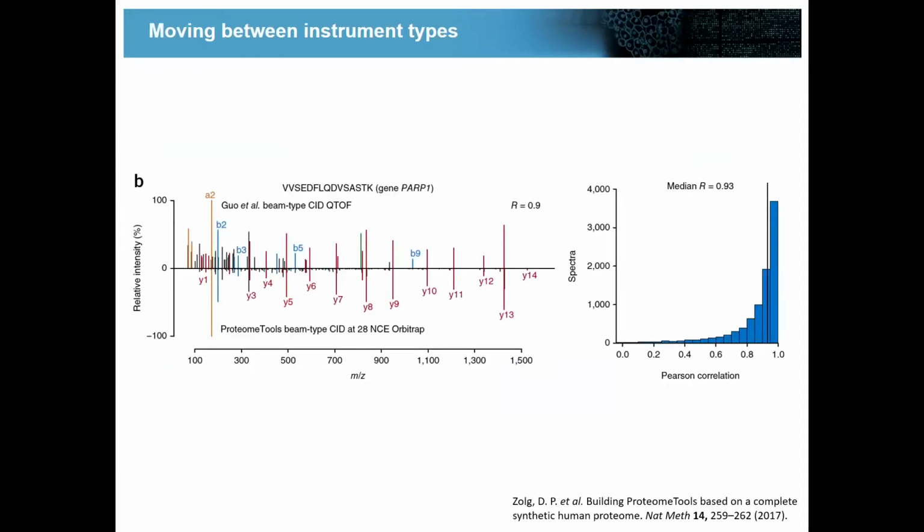Okay. The question is whether you can actually use these external spectral libraries. People always ask, well, can I use a library made in this other lab to analyze my data? The answer is maybe. It's not very satisfying, but it depends.